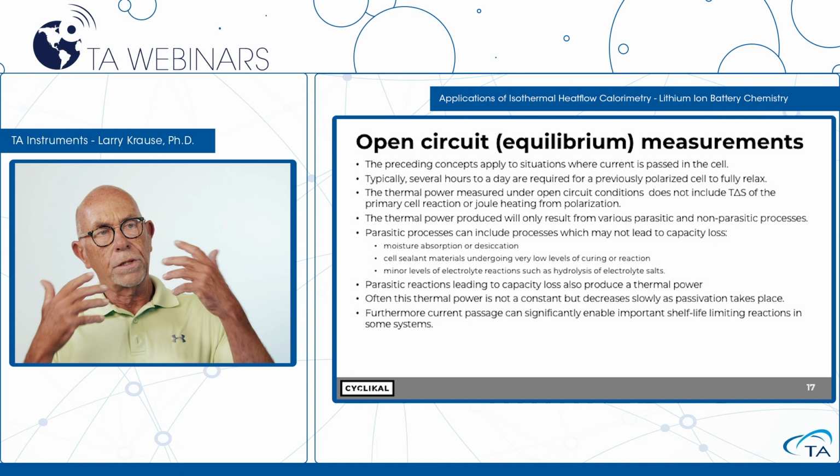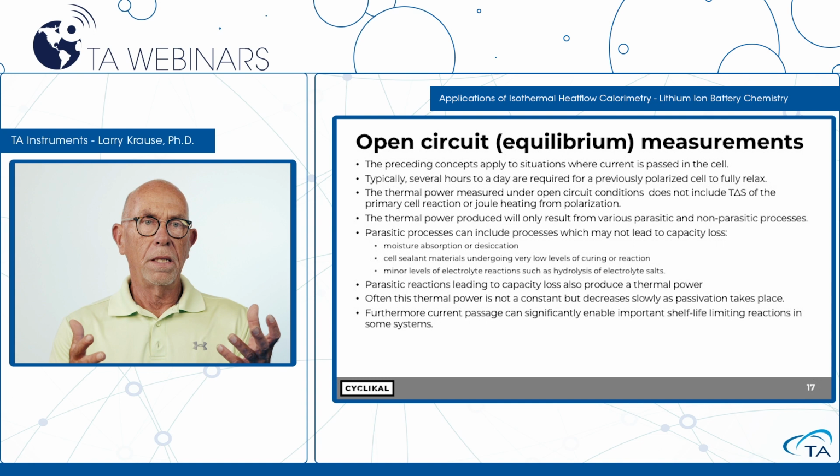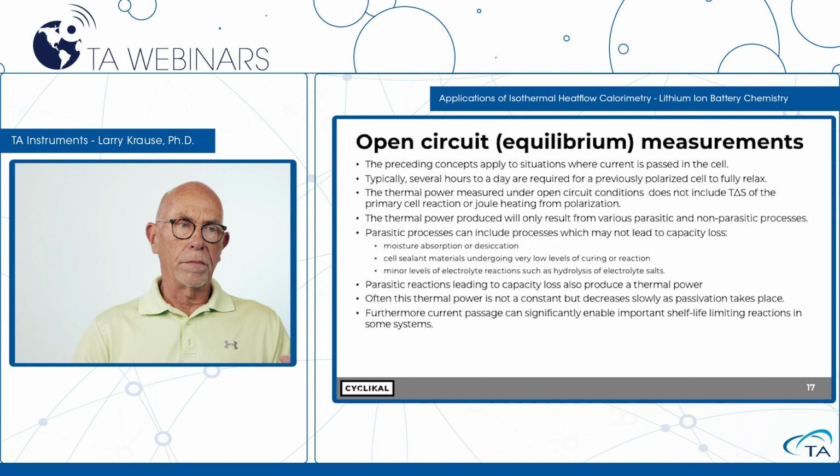the open circuit measurement can give you a lot of information, but it seems to me you have to have a lot of pre-information before you can follow and use the heat flow that you're measuring in the calorimeter with just an open circuit measurement.